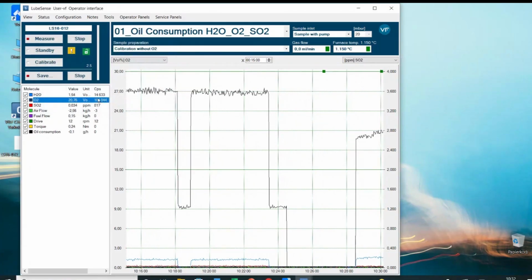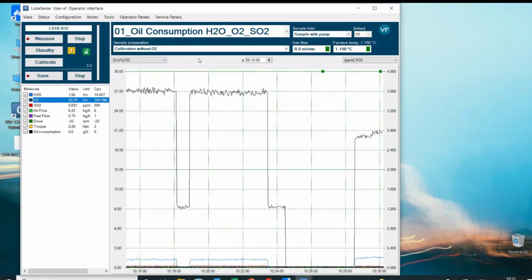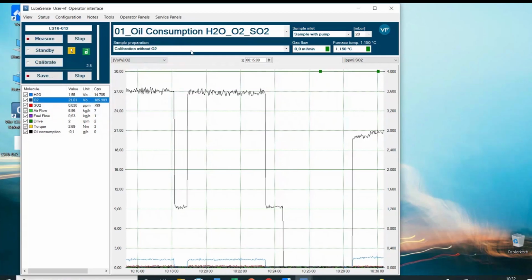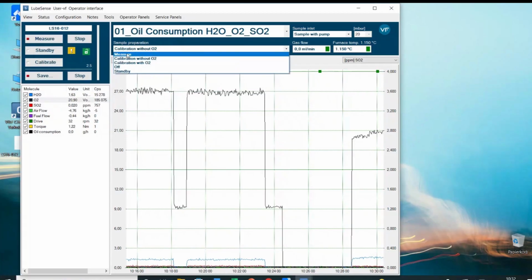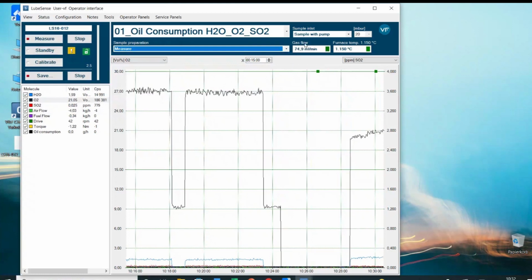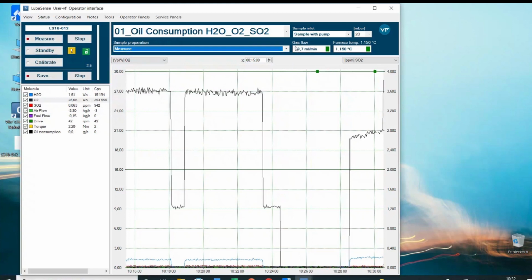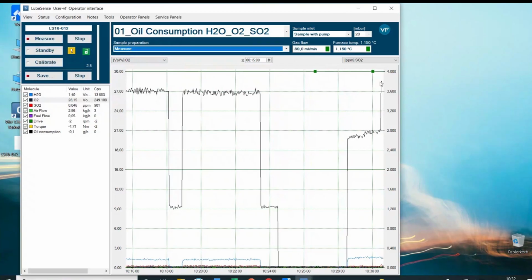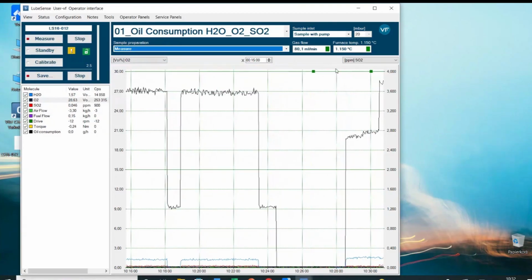Now for SO2, one thing is important. Before we can calibrate SO2, we have to set up the measurement flow throughout the system. Meaning, I will set the system, so the gas oxidizer, to measure. What will happen is we see, all right, the gas flow of the 100% oxygen bottle is being established. Therefore, we are also getting an increase in the oxygen signal itself. And what we want to do is the following. I will show this step by step.